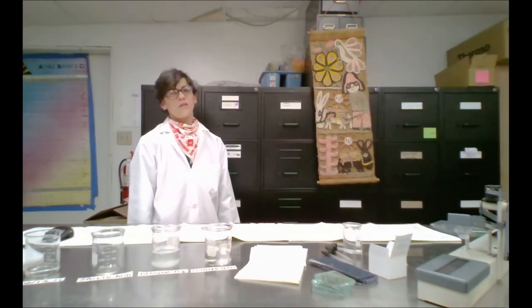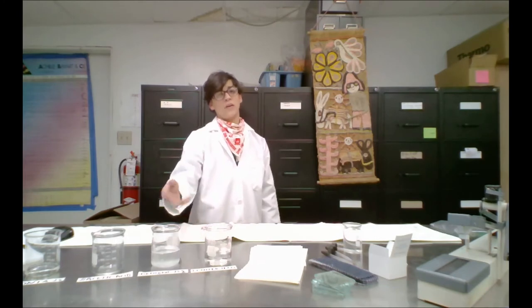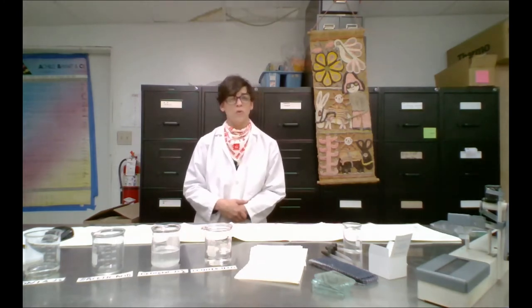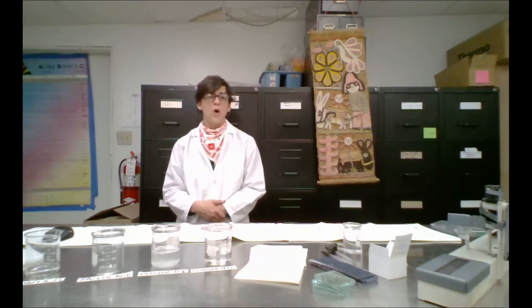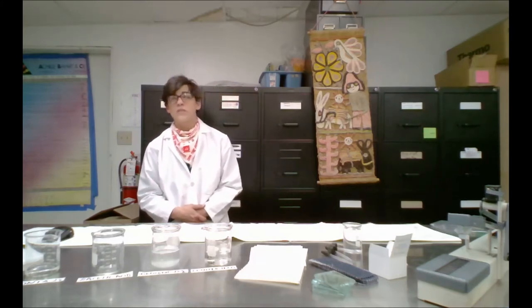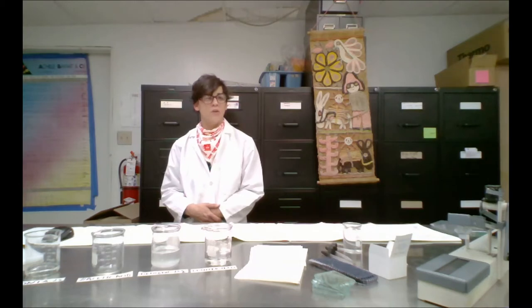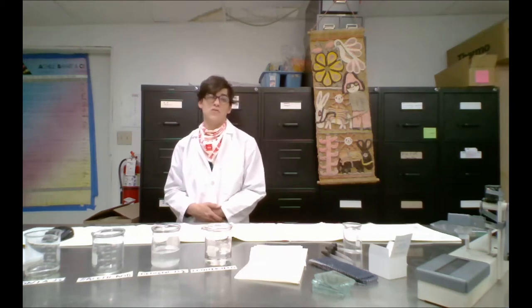Textile artifacts are tested before cleaning in aqueous or organic solvent solutions to determine if any colorant will bleed into the solution or transfer color to any adjacent fibers or materials. All color components, backing fabrics, repair fabrics, and yarns are to be tested to determine their potential for color loss or transfer.